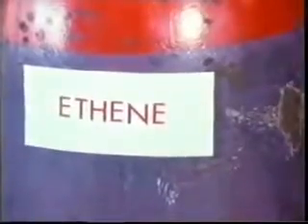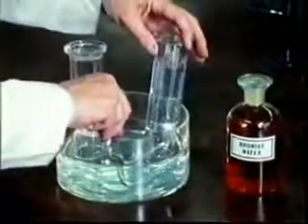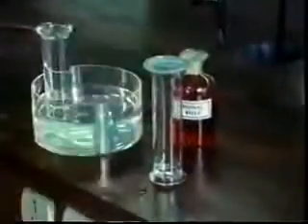This cylinder contains the gas ethene, C2H4. We'll collect some over water in a gas jar. You may have seen the reaction when ethene is shaken up with bromine water, which is coloured. It becomes colourless.